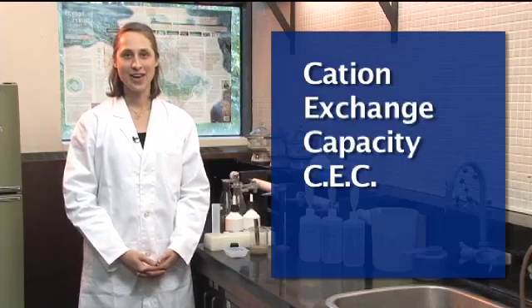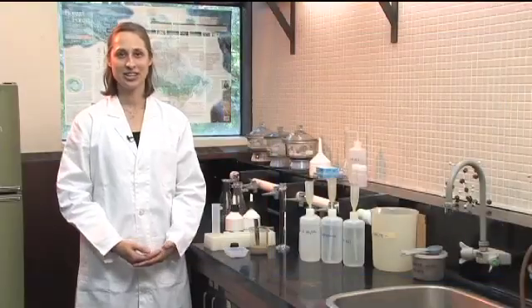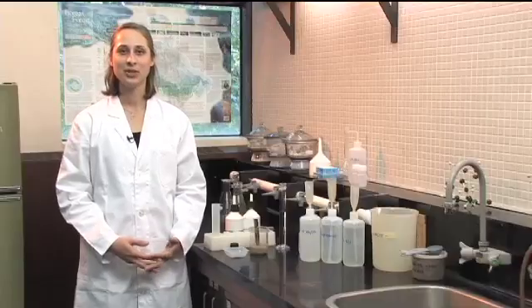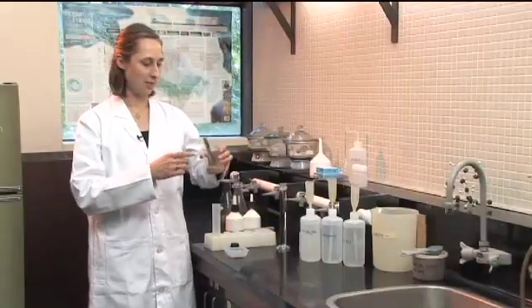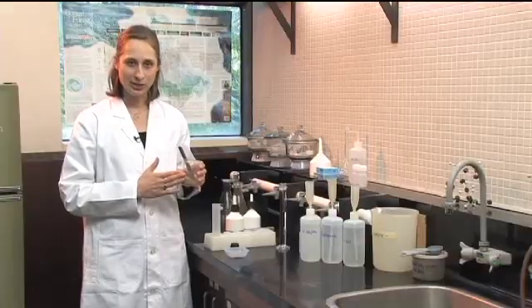We're going to look at how to do a cation exchange capacity measurement. Cation exchange capacity, or CEC, is a measure of the number of exchangeable sites within a soil for cations. The first thing we want to do is take our soil sample — it's air dried and sieved to two millimeters.